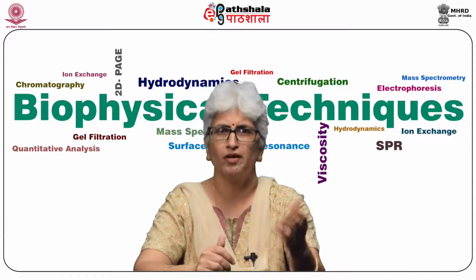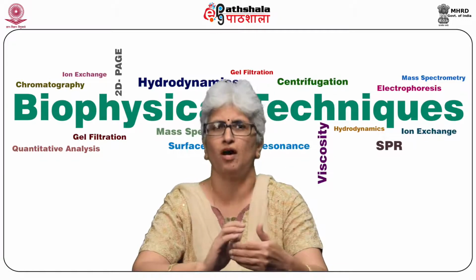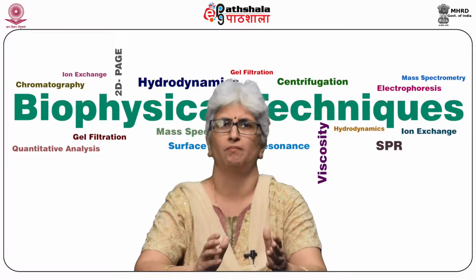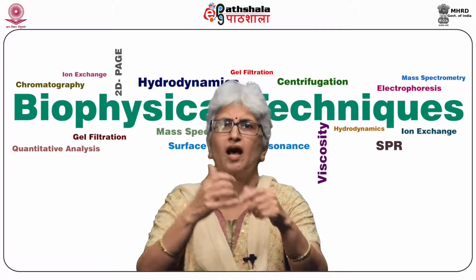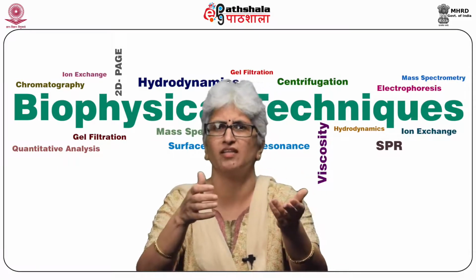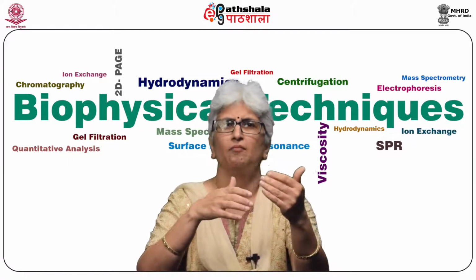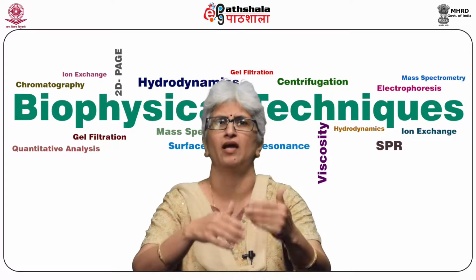Sample is then loaded onto the column, followed by column washing to remove unbound substances so that only target molecule is attached to the affinity column. Finally, the target molecule is eluted either by changing the buffer condition such as pH or ionic strength that destroys the interaction between target molecule and affinity ligand, or by adding a competitive molecule which has more affinity to the ligand.